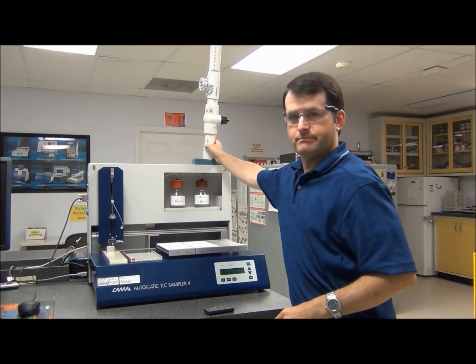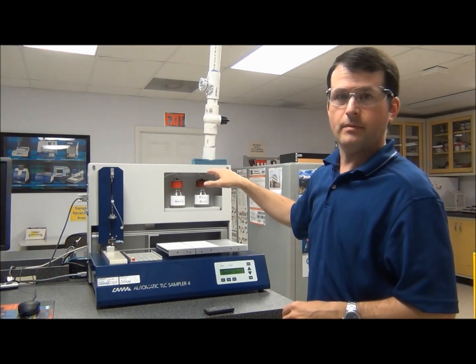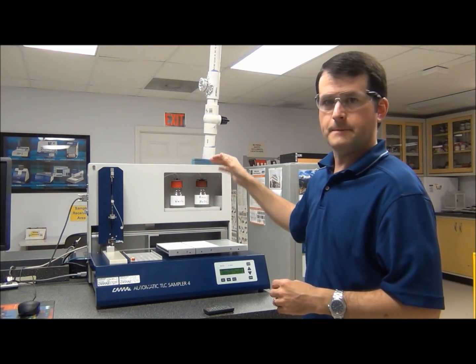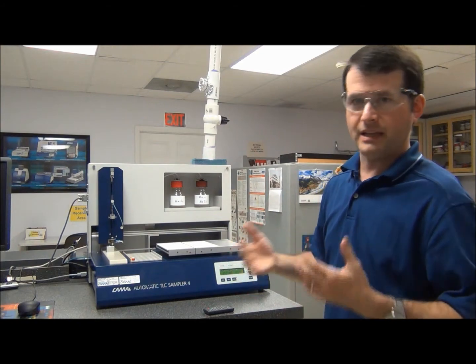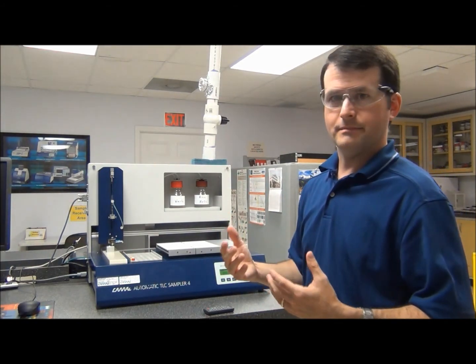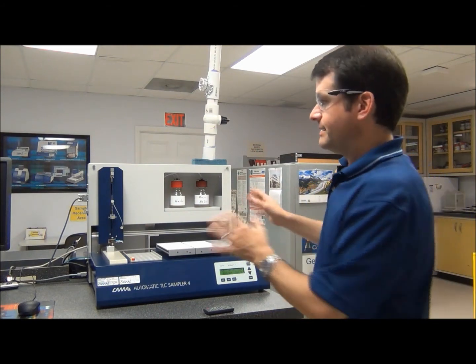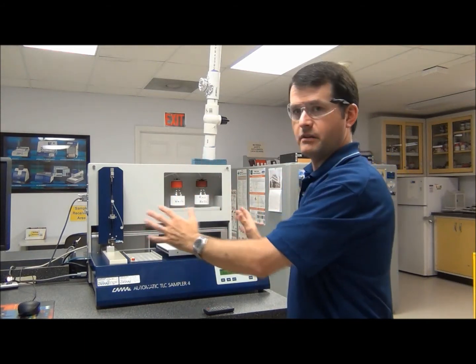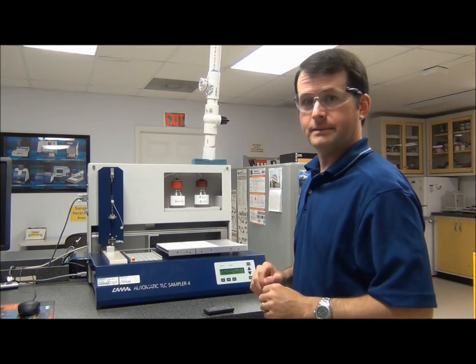You'll also see a connection back here — this is actually something we've done in our lab. It's a custom connection that fits on top of the cover and connects to the hood, so if you're using any chemicals that are kind of nasty, it will draw up the fumes. We've had some customers who have done that in the past. It's just a plastic cover so you can cut it or modify it however you want. I've removed it here for clarity's sake.